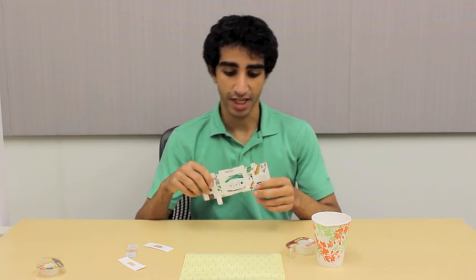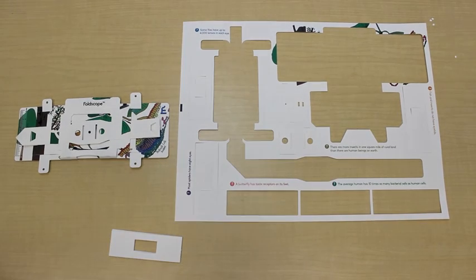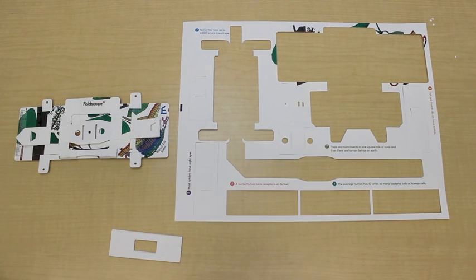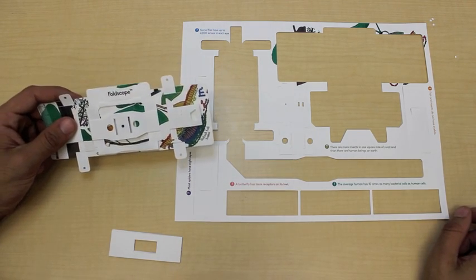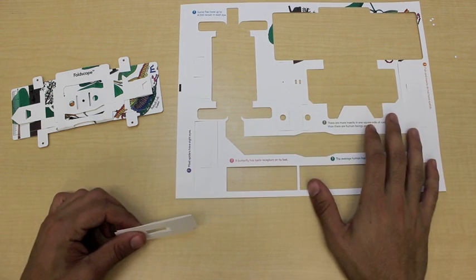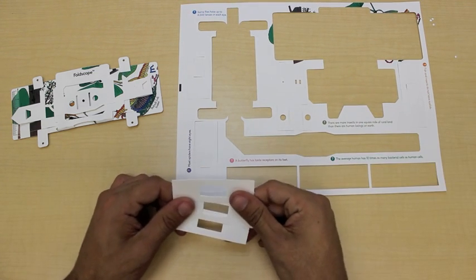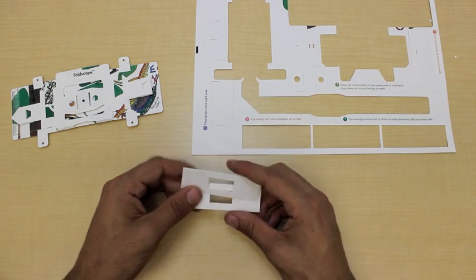You'll also need a folded foldscope to be able to view your slides after you've made them. An important part of microscopy is preparing your own slides. The foldscope accepts standard glass slides. However, if those aren't an option, you can also make your own paper slides. In this step, I've cut out three paper slides from the cutout sheet, and we'll use it to prepare our sample.